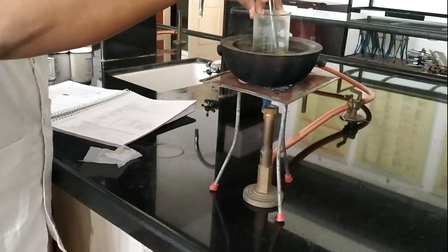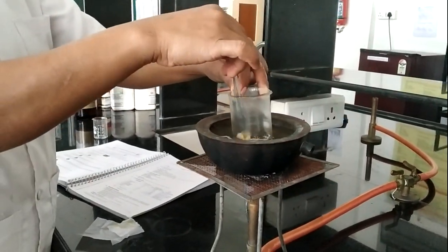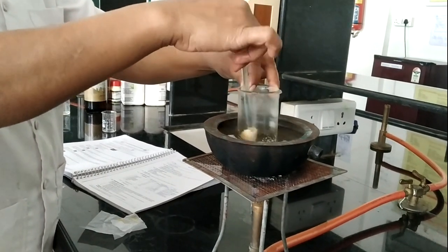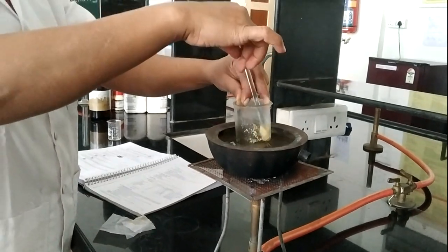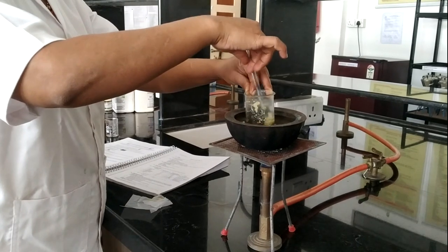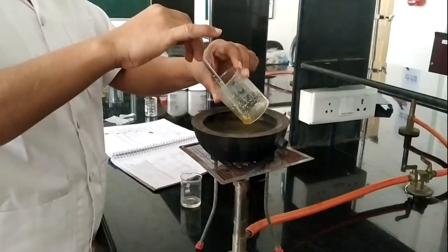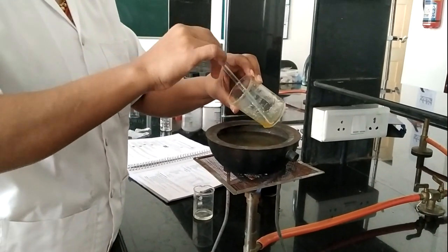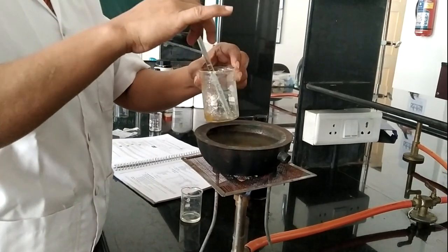Keep this beaker in the water bath and maintain up to 60 degrees Celsius. Stir it well. Almost all the stearic acid has mixed with the lanolin and liquefied.